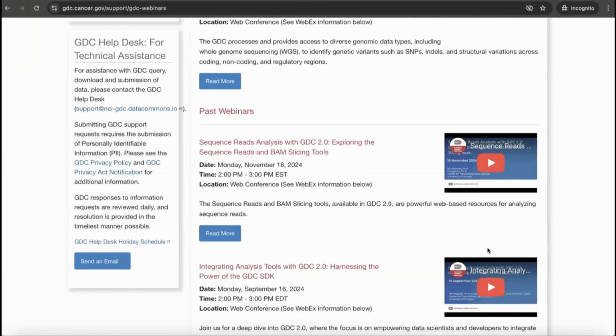The next question: are all GDC whole genome sequencing data from short read sequencing? Currently, yes. We do have some data sources with different data types, and you might also know TCGA also tried some different data types before, but we don't have a pipeline to process this data. So currently, we don't have a plan to process anything other than the short read.